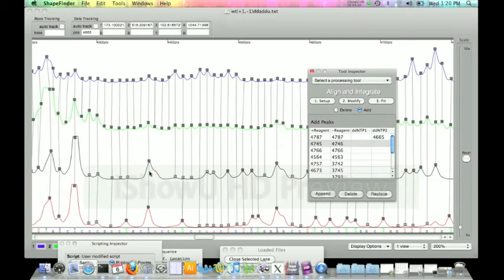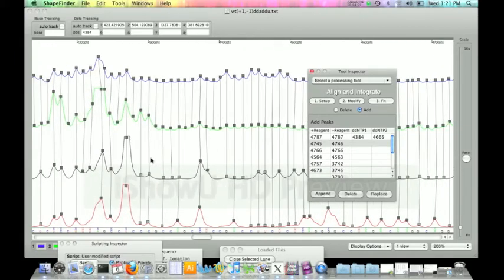We have a peak in both our DDA ladder and our DDU ladder, but clearly it isn't either. It's a C. So our data is still lined up because you can see that this DDU peak here lines up with these A's, no problem. Our U, there's a little bit of a bump here, so I would definitely say that this is a U peak. No problem. Alright, so our data still lines up, but sometimes you will get mixed signals in your ladders, so it's not always going to be 100% perfect with your sequence. That's where your discretion comes in. You really have to play it a little bit at a time.